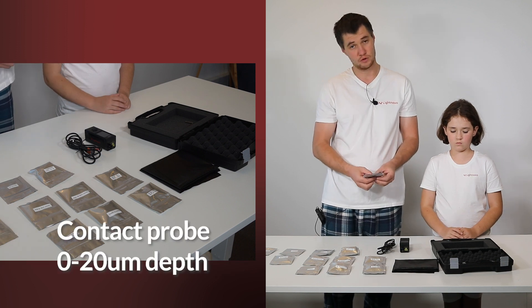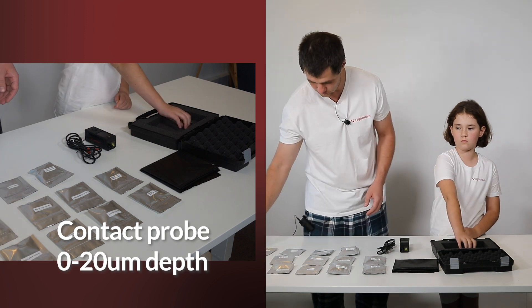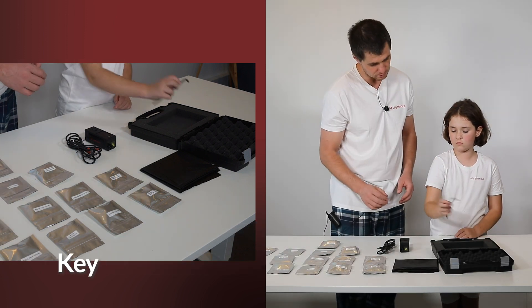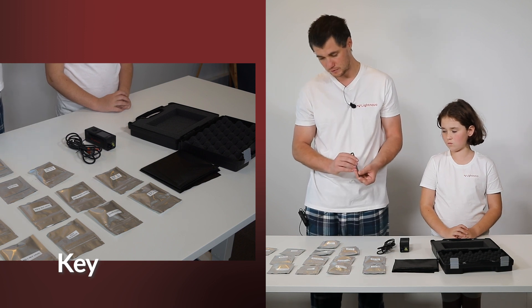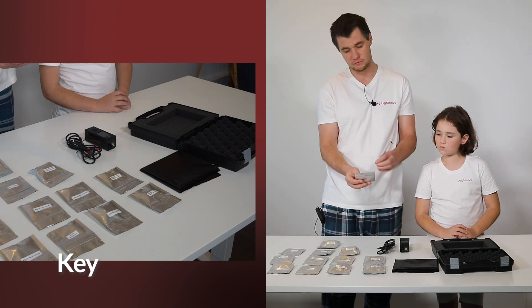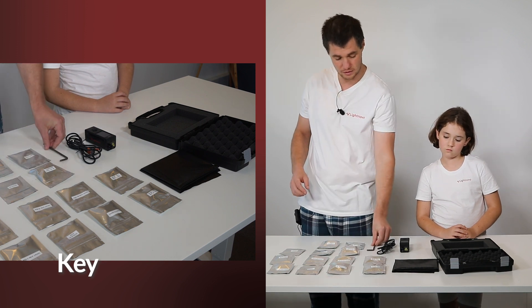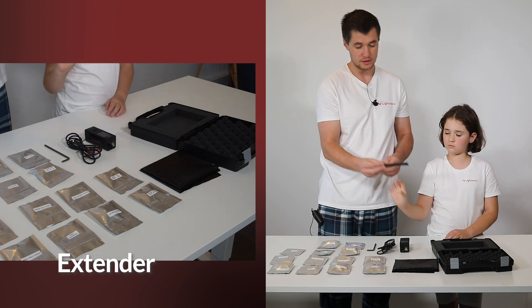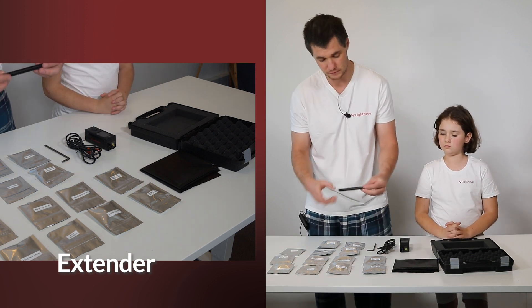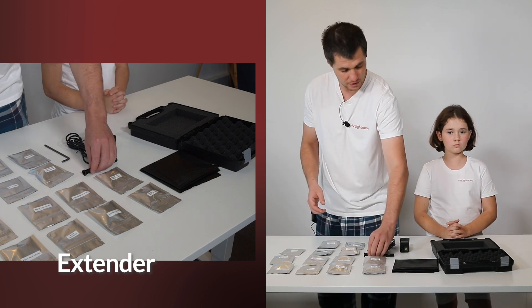Contact probe for penetration depth 0 to 20 microns. We also have the key — this key we supply together with sample screws, which you will press your powder to do measurements. And finally this is an extender which you can use with any of our Raman probes to have extended operation.